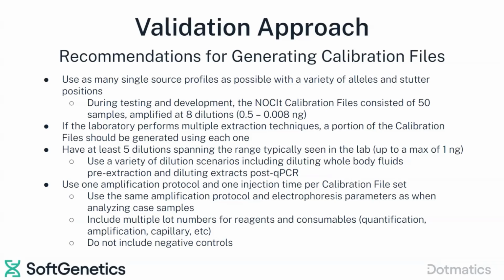You'll want to have at least 5 dilutions that mimic the range that you see in your lab.